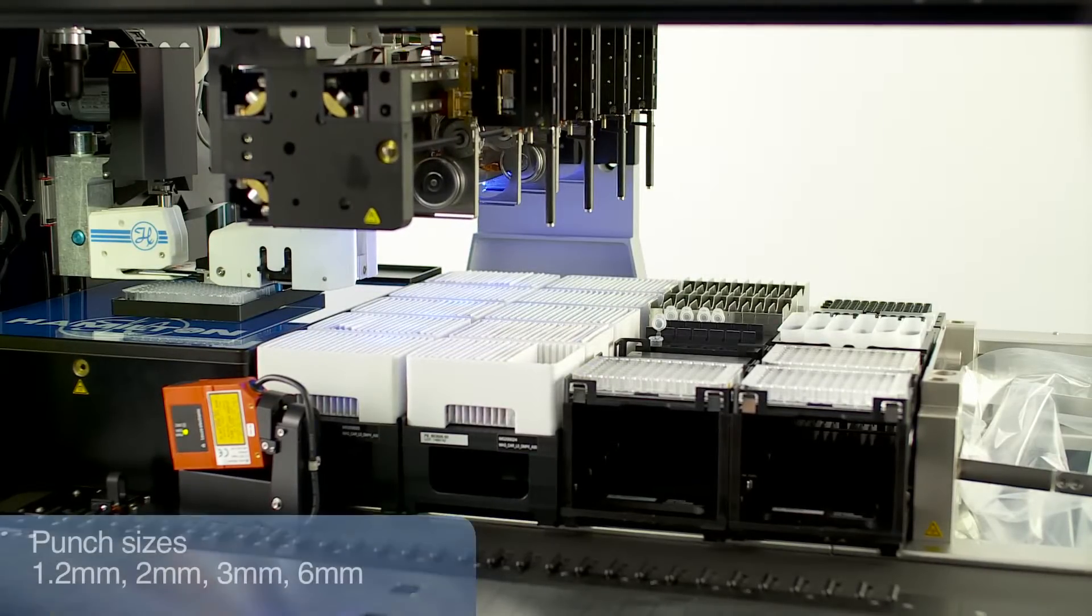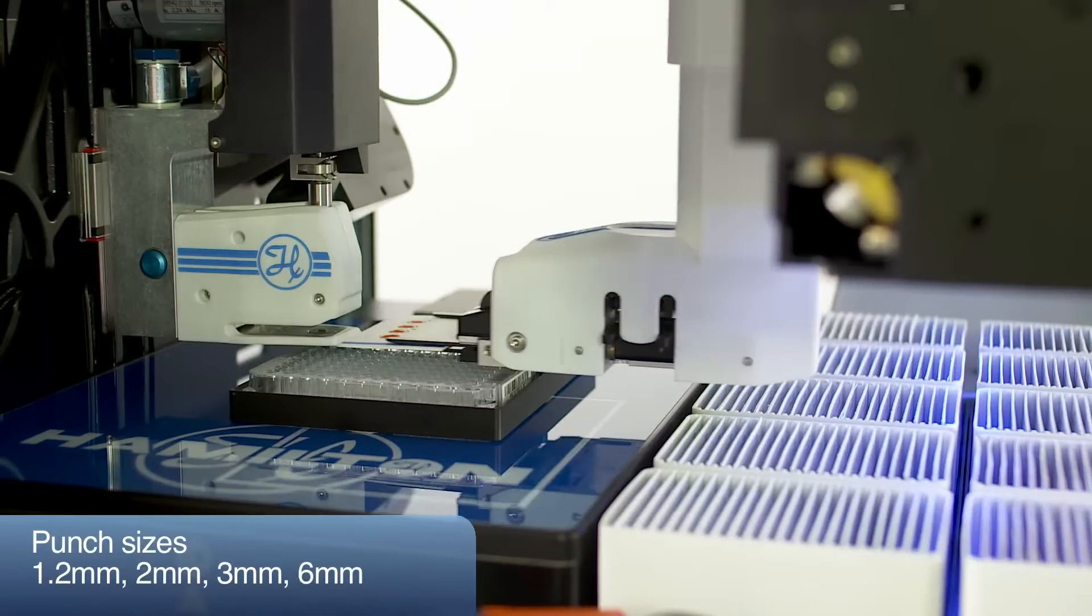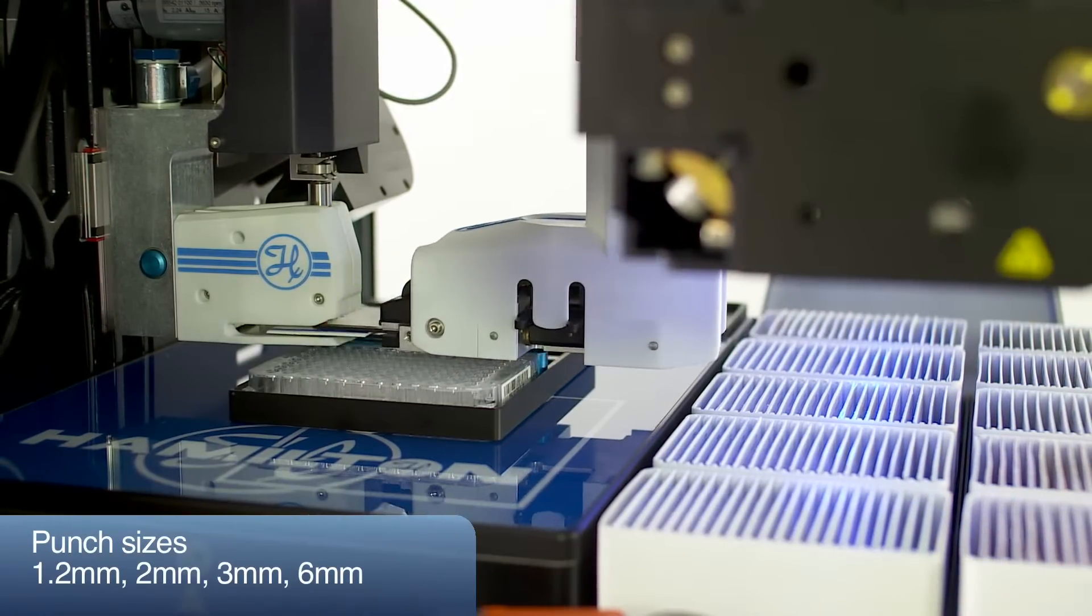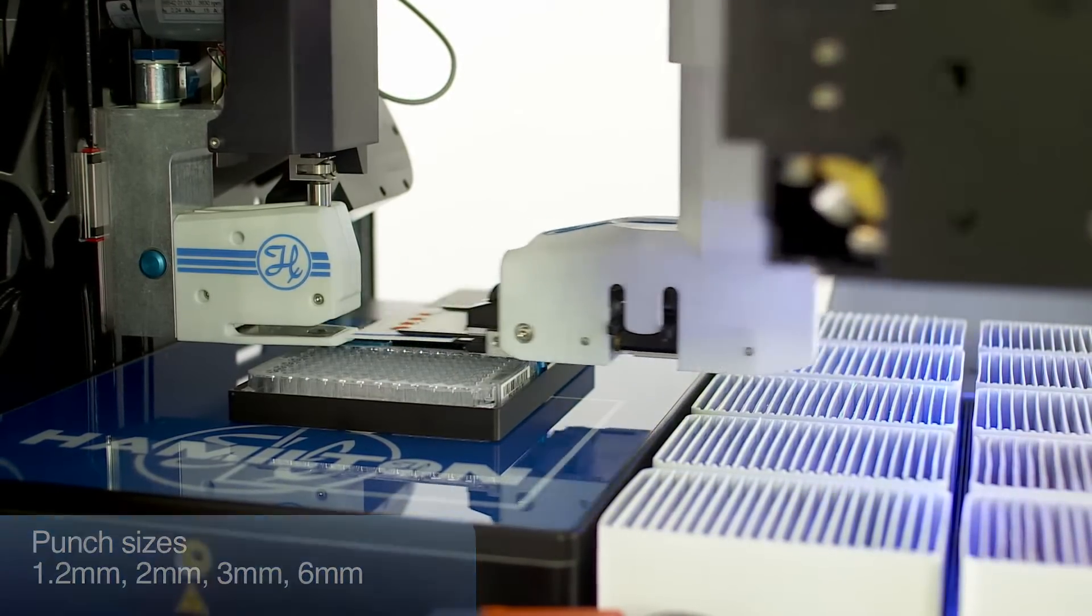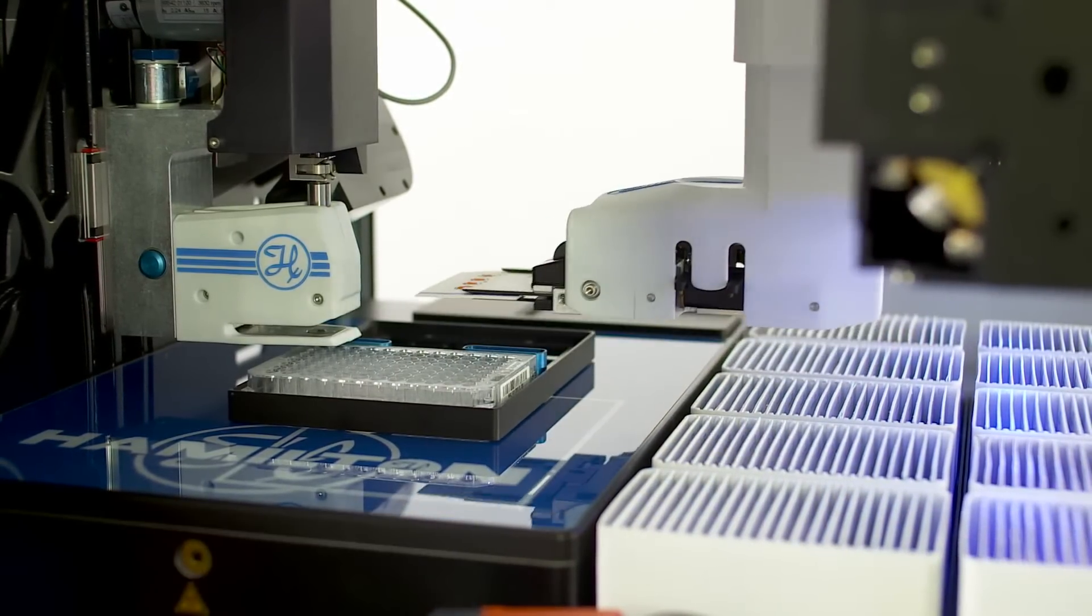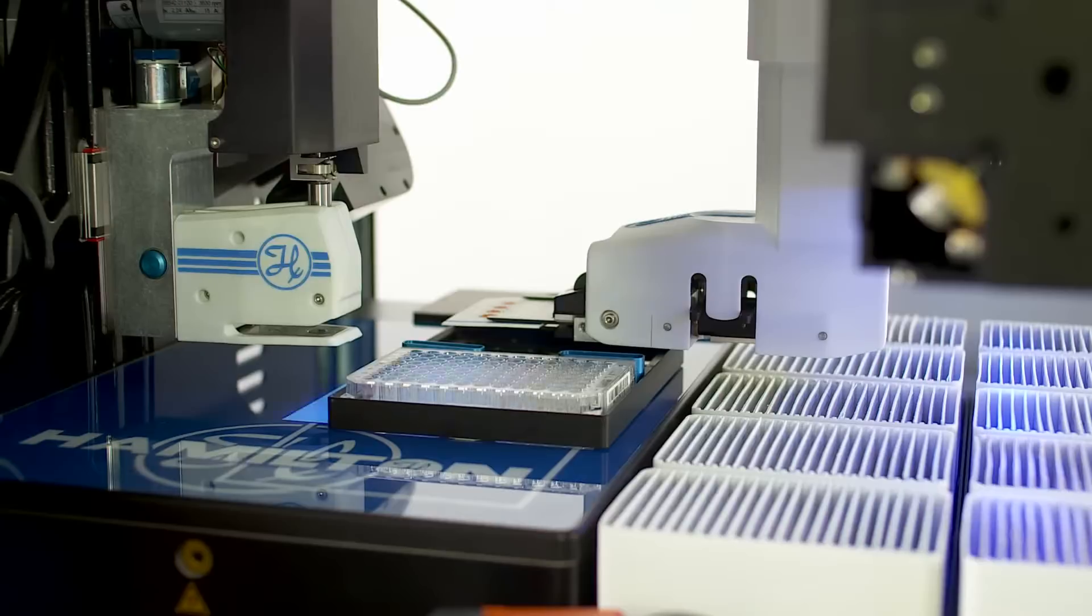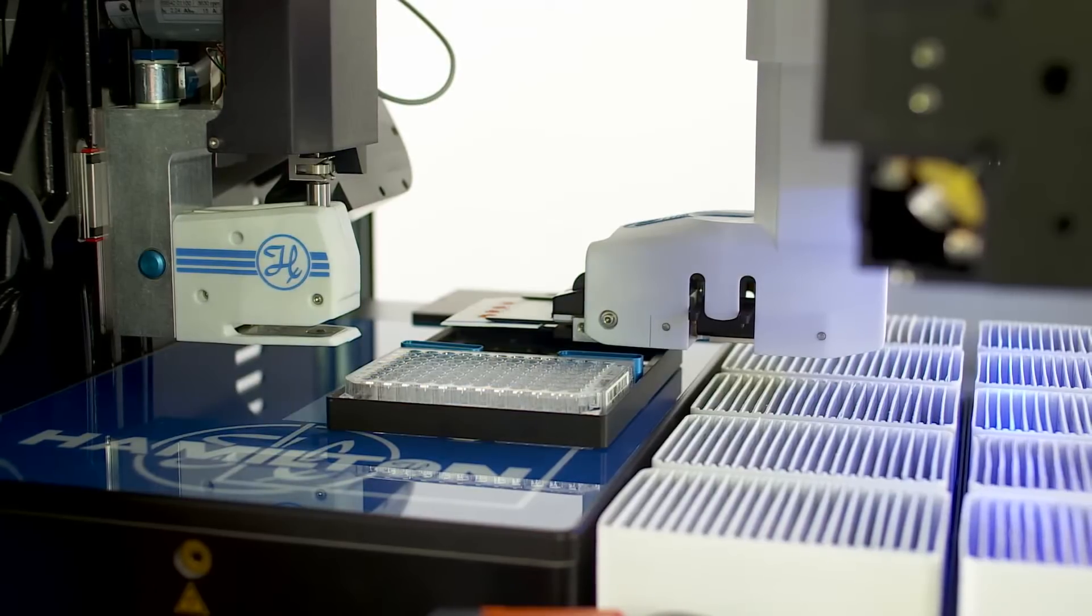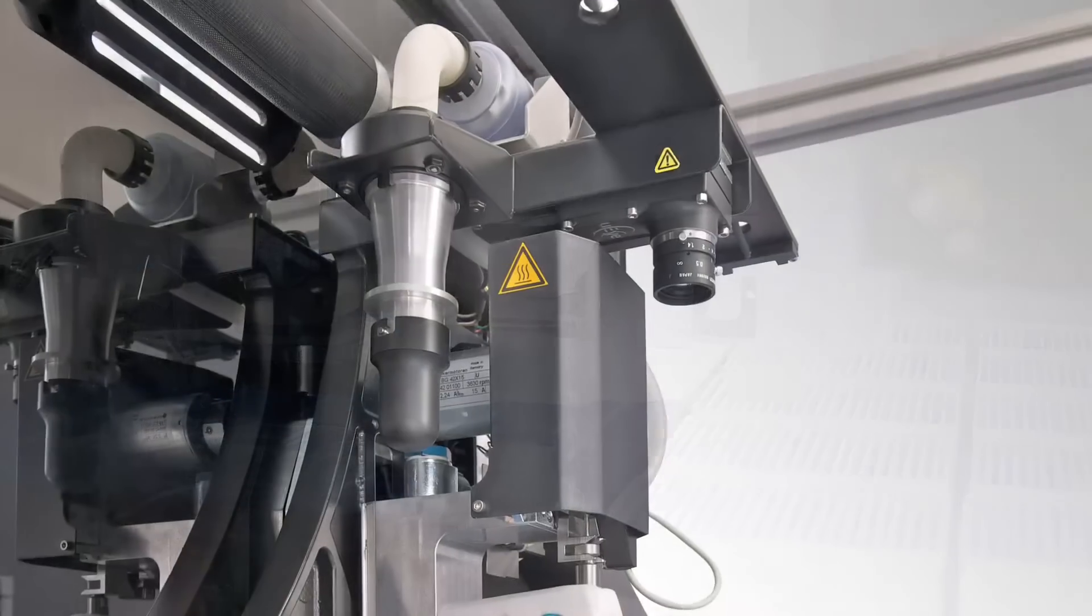Different standard punch sizes of 1.2 mm, 2 mm, 3 mm, and 6 mm are available. To avoid contamination, cleaning punches can be made either from the same or from separate cards.